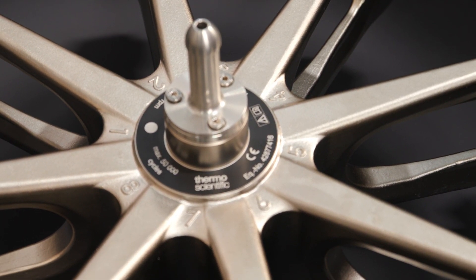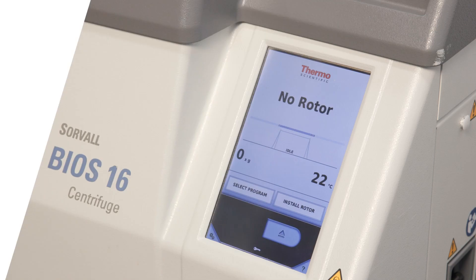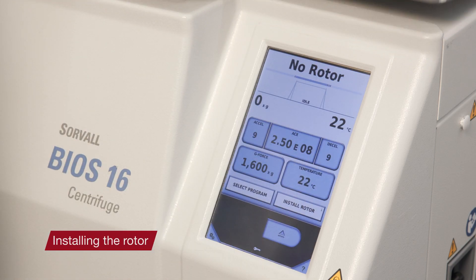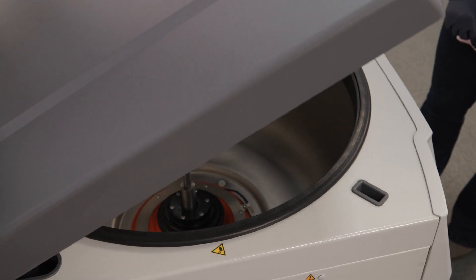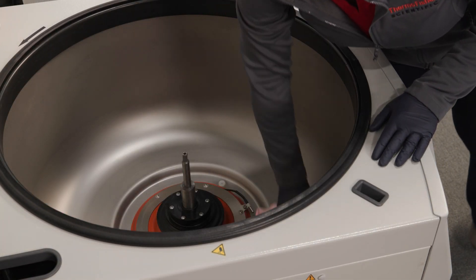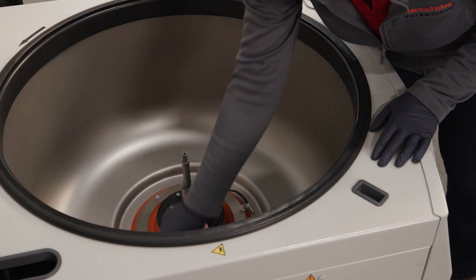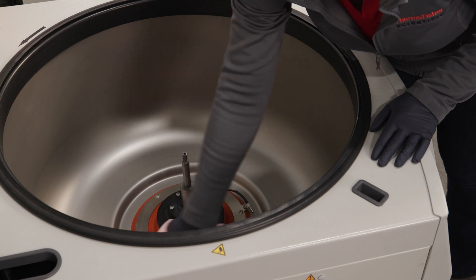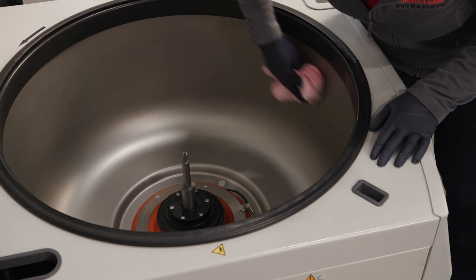Next, we'll cover how to properly install the rotor. First, turn on the centrifuge and press the open door button on the touch screen. If necessary, remove dust and foreign objects from the chamber. Wipe the driveshaft with a clean cloth and clean the threads of the driveshaft to prevent possible damage to the rotor or centrifuge.